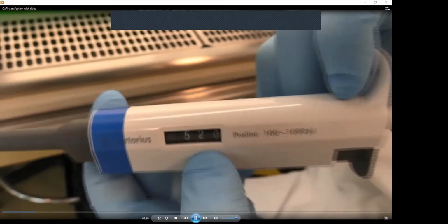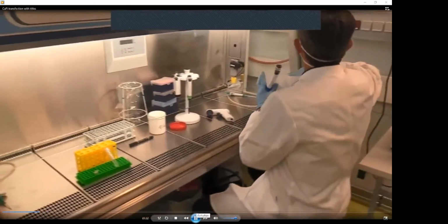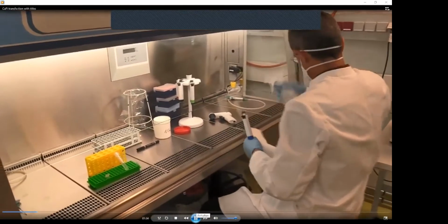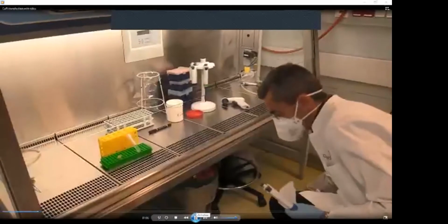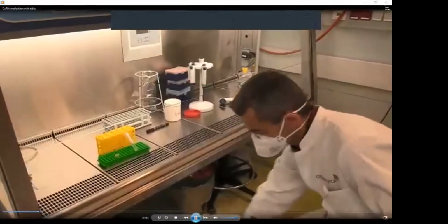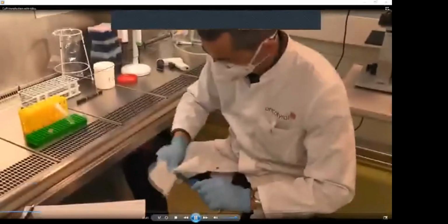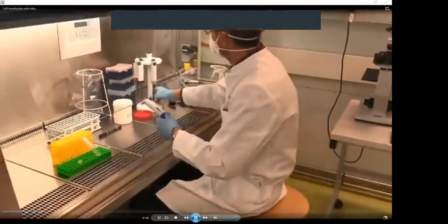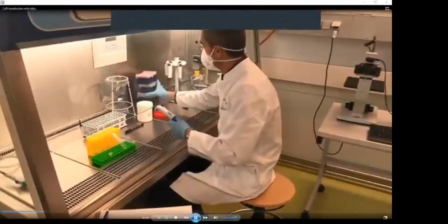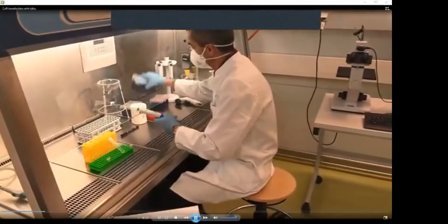So 520 microliters. Then one technical detail: always when you work with tissue culture, you have to clean the lower part of the pipettes with 70% ethanol, because although you are using autoclaved tips, it can happen that you touch something with the pipette itself, and that leads to contamination of the sample.